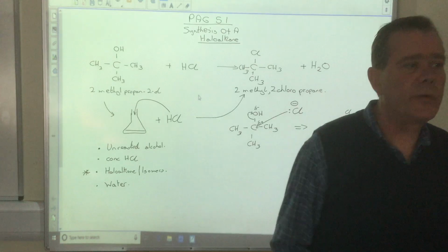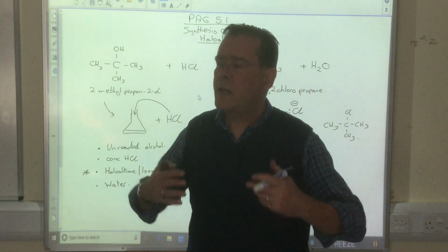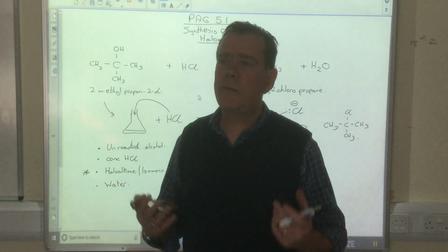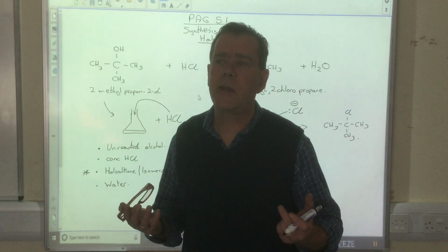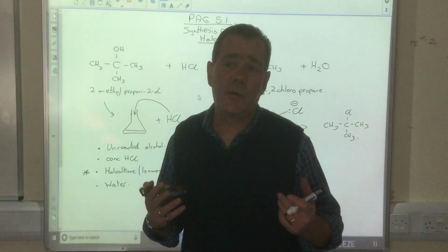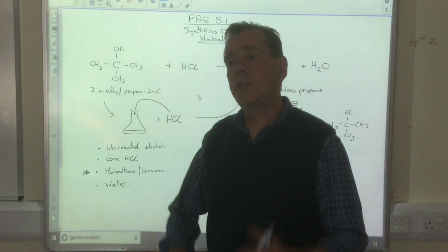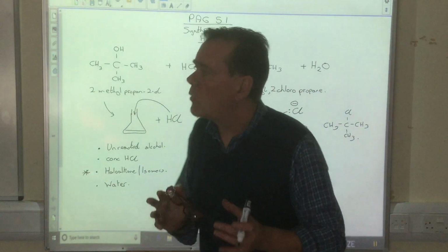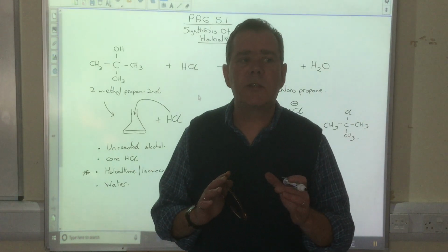Now, how do you separate that lot? You wouldn't do distillation of that lot straight away. It's not the right thing to do. There's a better way of separating things. Distillation is a more fine-tuned way of separating things, when you've got a couple of organic compounds with different boiling points. This, you've got a right mixture of stuff. So you have to use a technique that works better than distillation.